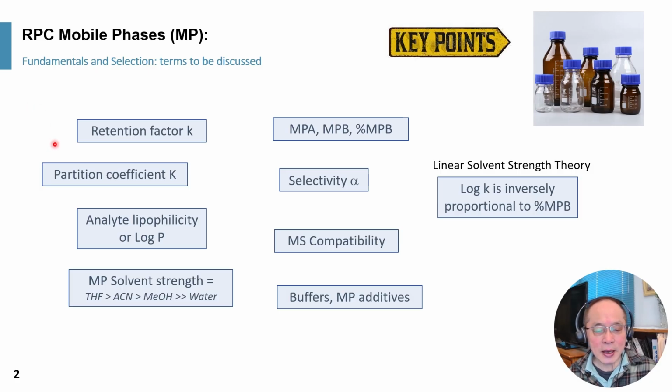Retention factor small k and partition coefficient big K are highly correlated under reverse phase condition. A separation by reverse phase is according to analyte hydrophobicity or lipophilicity, also correlated with a term called log P, very common in use in the pharmaceutical industry.